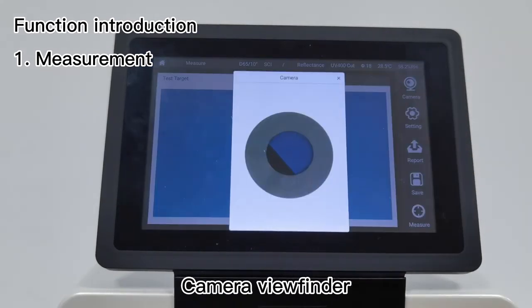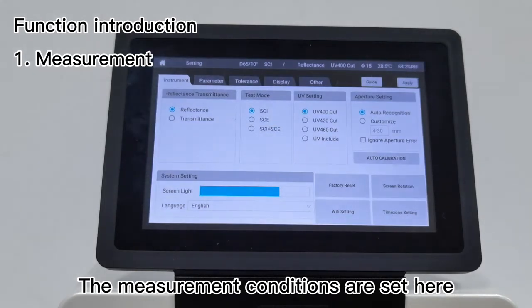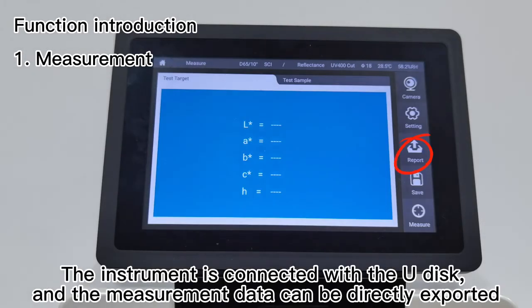Instrument setting function allows measurement conditions to be set here. The instrument is connected with the U-disk and measurement data can be directly exported.